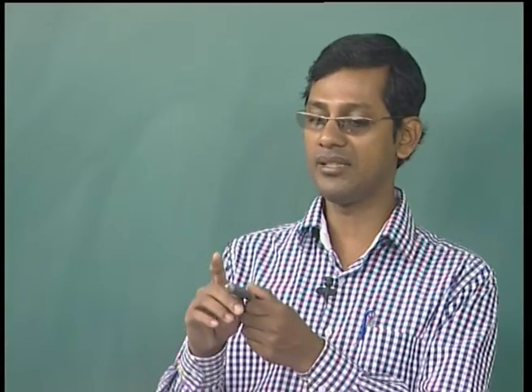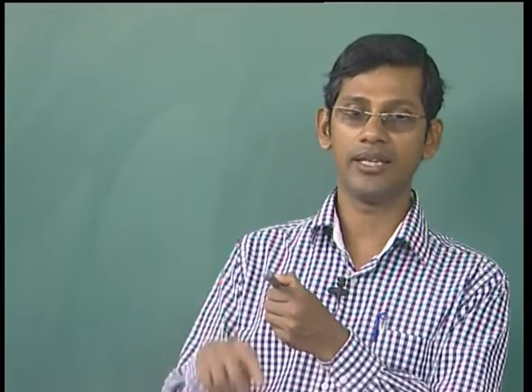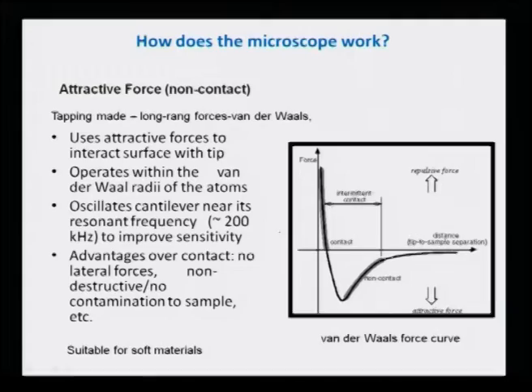this resonance. Basically, if I have a tip like this, I just keep tapping so that it resonates, or it just does like this, and once it does, it measures the long-range forces. That is why it is called tapping mode. It has many advantages over the contact mode.